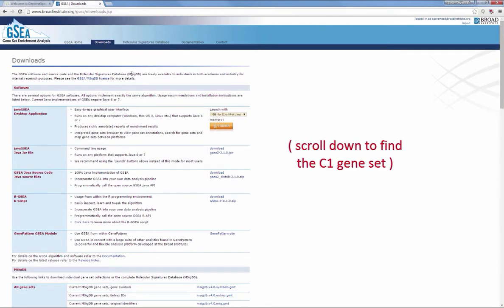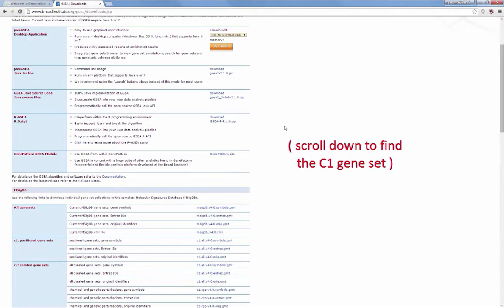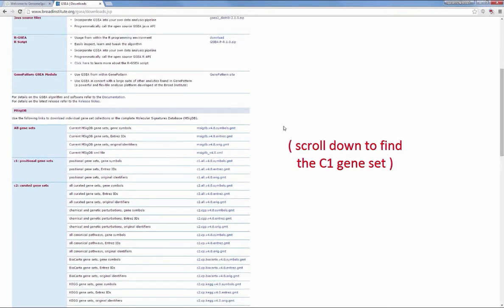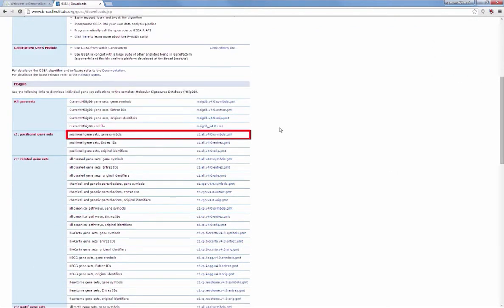Scroll down through the table to find the positional gene sets, C1 collection. Click the c1.all.v4.0.symbols.gmt link.